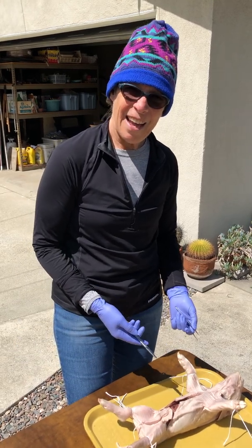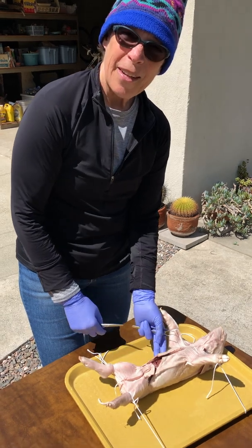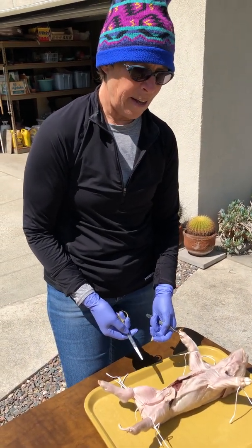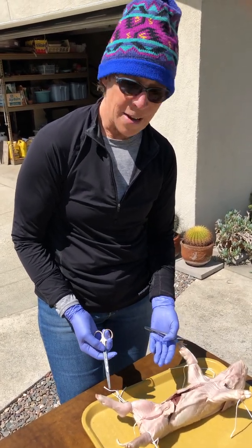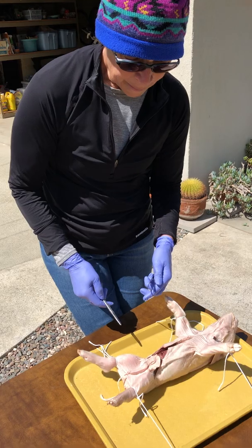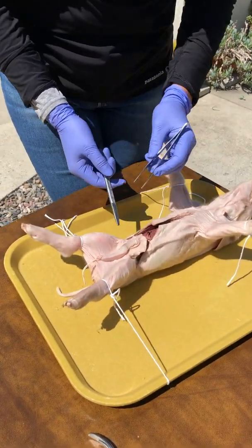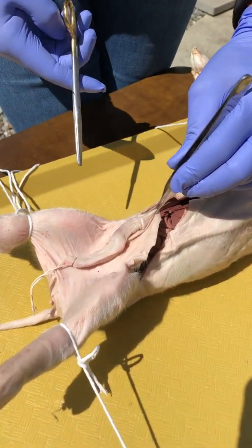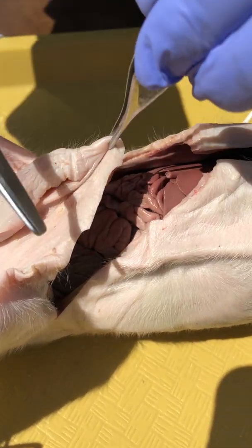All right, so getting into the cavities. I've already started making some cuts but I wanted you to see what I'm doing, because if I go too far you're not gonna know how it got to look the way it does. So the idea to get into the body cavity — the method that I like to use — is to just pinch the body wall.